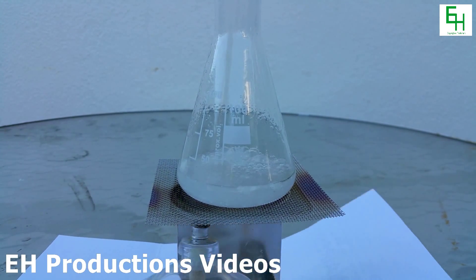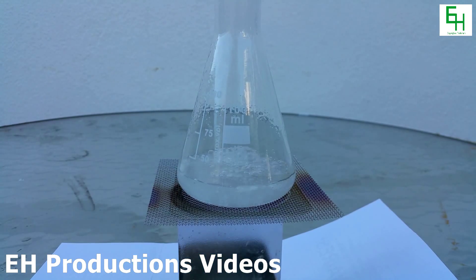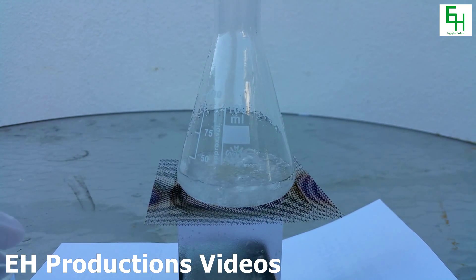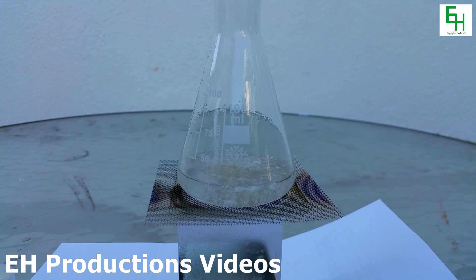Alright it's starting to boil. I'm going to take the heat away. And as you can see even though I took the heat away the solution is still boiling. I'm going to add in some more of the silica gel.